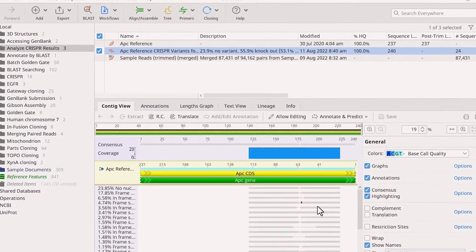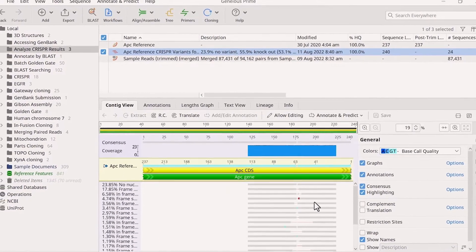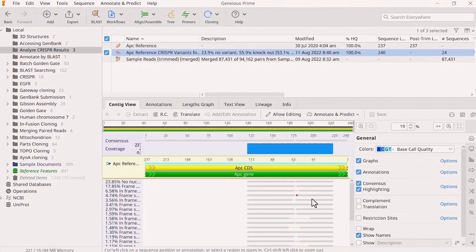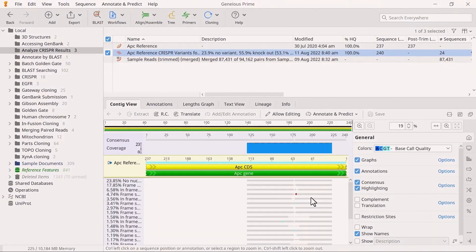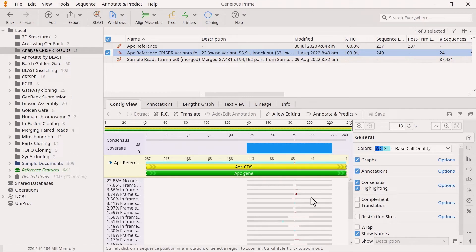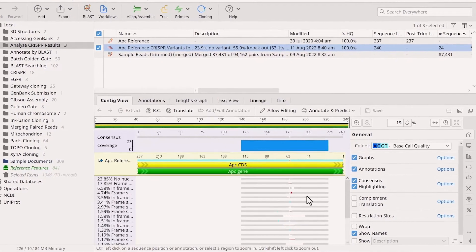Geneious will create an alignment file. This file is similar to the output from a map to reference, but instead of showing each read aligned to the reference, only one representative of each identical cluster is aligned.